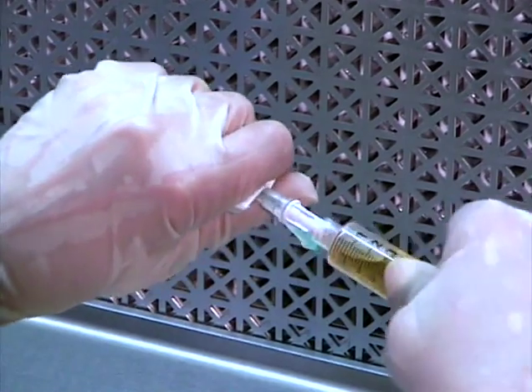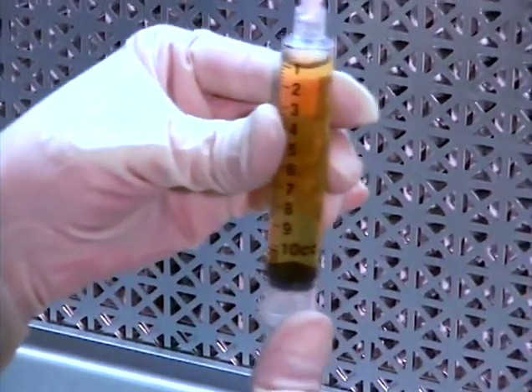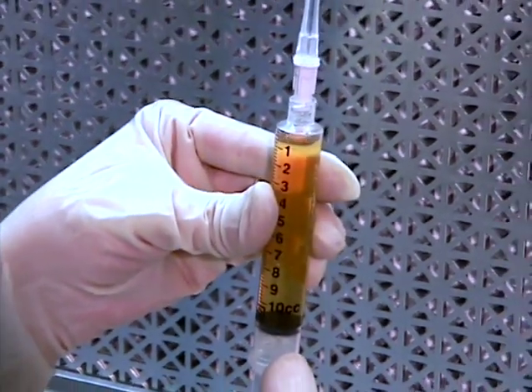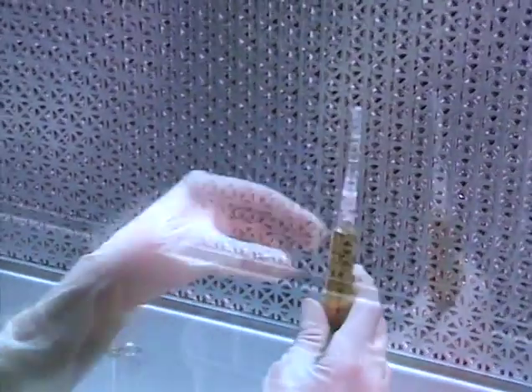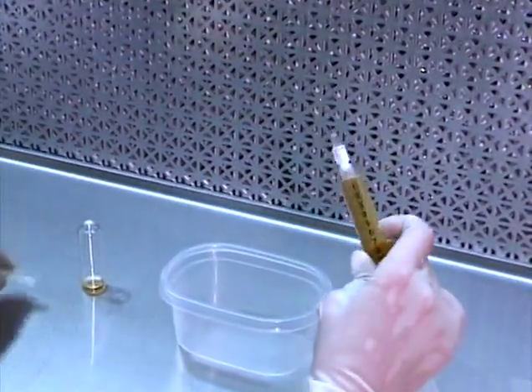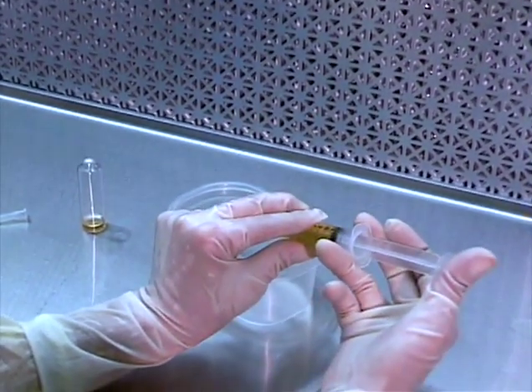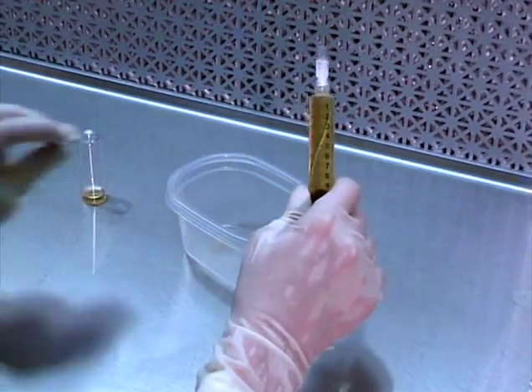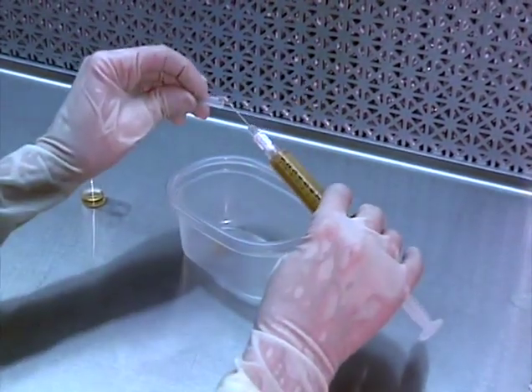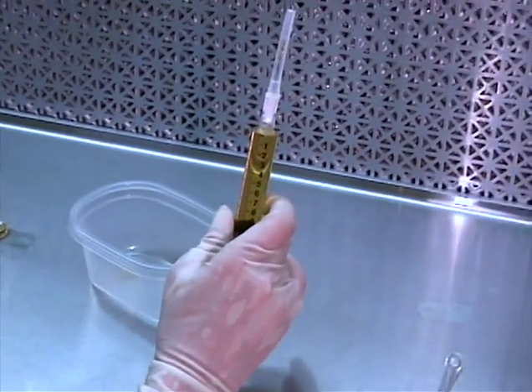Change to the filter needle. Carefully refill the needle and make the final dosage adjustment, disposing of any excess carefully, in accordance with policy. It does not matter whether you use the filter needle to draw up the fluid or to inject it into the final solution, except when drawing up a dose in a syringe that will be sent directly to the floor. Otherwise, it is generally easier to push through the filter needle than to pull.